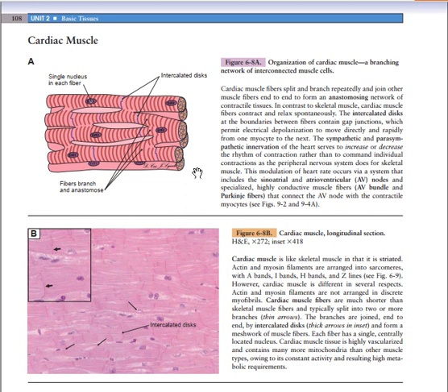So here we're going to visualize the cardiac muscles. As you have already seen in the part 1 muscular tissue tutorial, we are going to revise the fact that the cardiac muscles are branched, as you can visualize here, and then they are connected. One cardiac muscle, which has only one central nucleus, is connected to multiple other cardiac muscles by the intercalated disc. This disc is made up of multiple gap junctions in order to transmit electric impulses from one cardiac muscle to another.